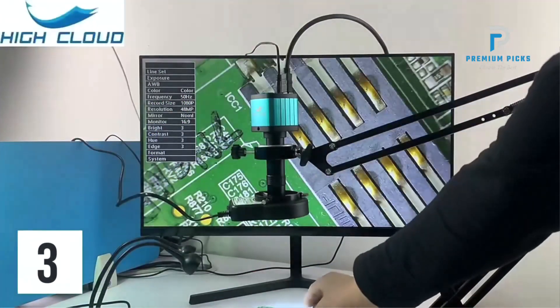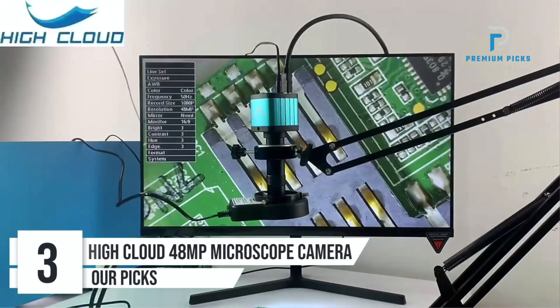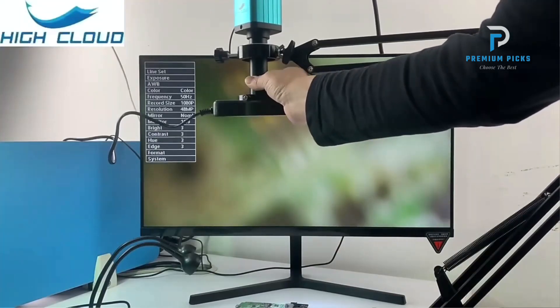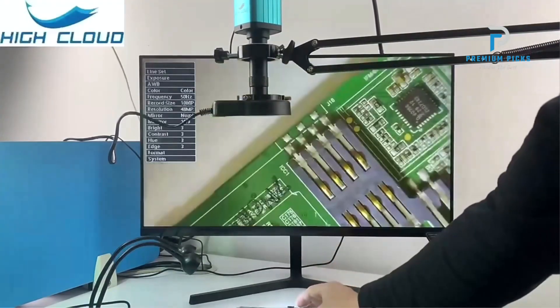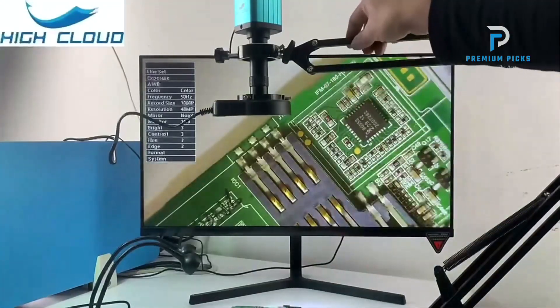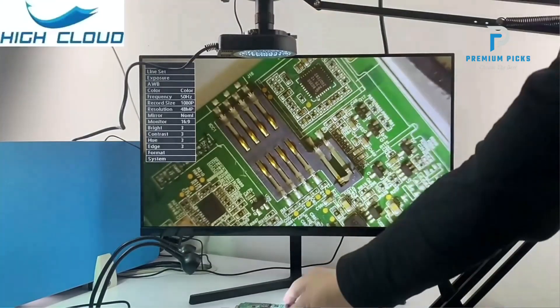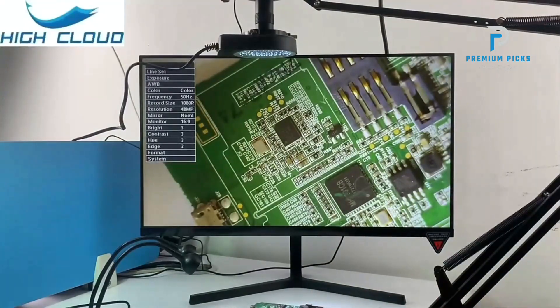Number 3: High Cloud 48MP Microscope Camera. Boasting a 48-megapixel Panasonic sensor, this microscope camera delivers stunningly clear and detailed images, providing exceptional clarity in your observations. Equipped with HDMI and USB 2.0 outputs, the camera offers seamless connectivity to HDMI monitors, projectors, TVs, and computers, allowing for convenient viewing and recording of live images. It also features a 130x zoom C-mount lens with digital magnification of up to 5x.